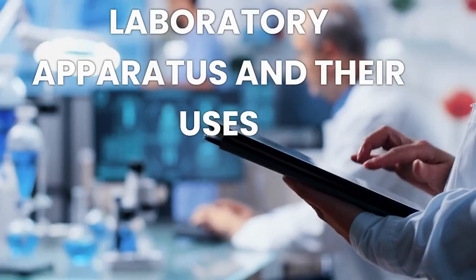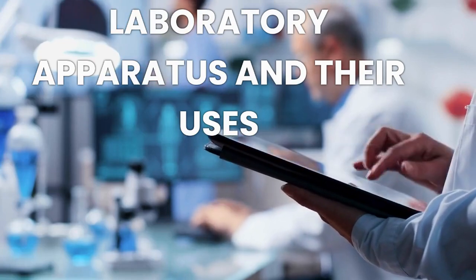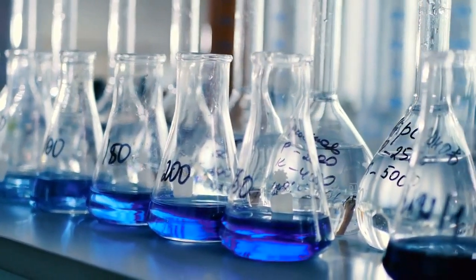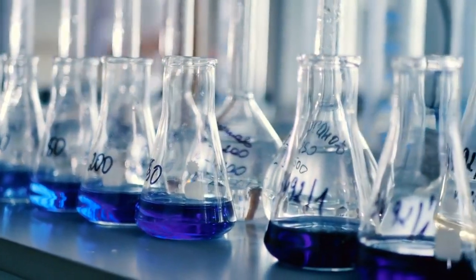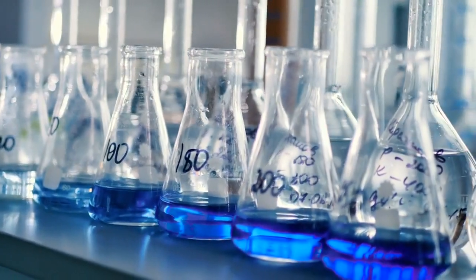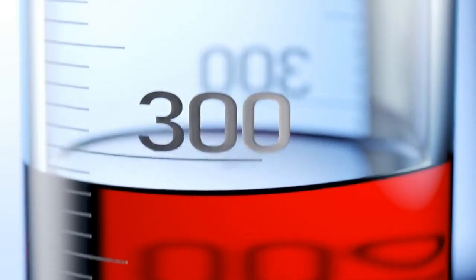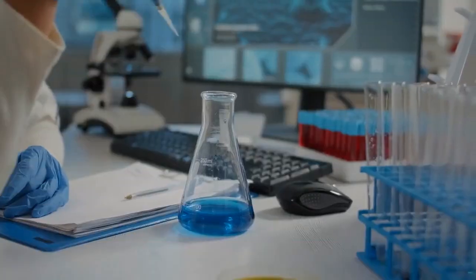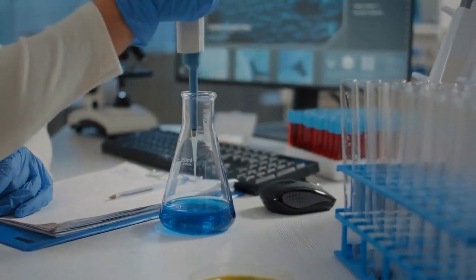Our topic for today's class is laboratory apparatus and their uses. Laboratory apparatus refers to the various tools, equipment, and instruments used in scientific research, experimentation, and analysis in a laboratory setting. These apparatus are designed to perform specific tasks, measurements, or manipulations required in different scientific disciplines. Here are some commonly used laboratory apparatus.